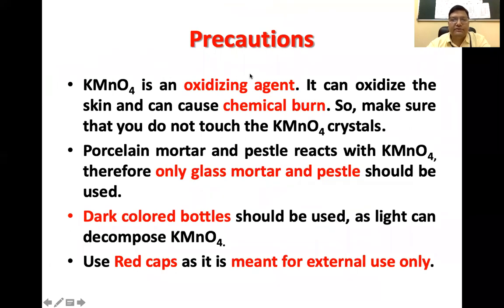Then there are certain precautions which you have to follow. Potassium permanganate is an oxidizing agent and it causes chemical burns. It oxidizes the skin. So you have to be sure that you do not touch potassium permanganate crystals, and you use glass and mortar and pestle while making this preparation. Dark colored bottles are to be used for dispensing this preparation, as light can decompose potassium permanganate. And we cover it with the red colored cap. Red cap indicates that the preparation is meant for external use only.